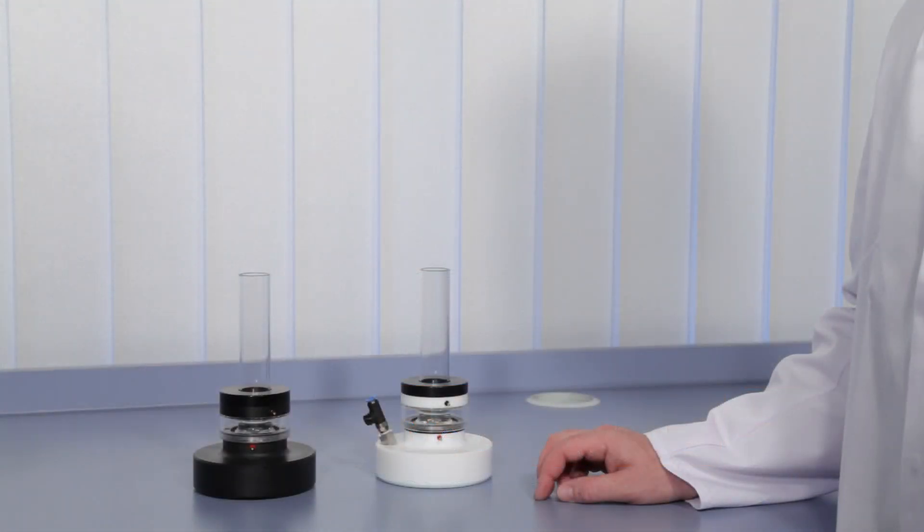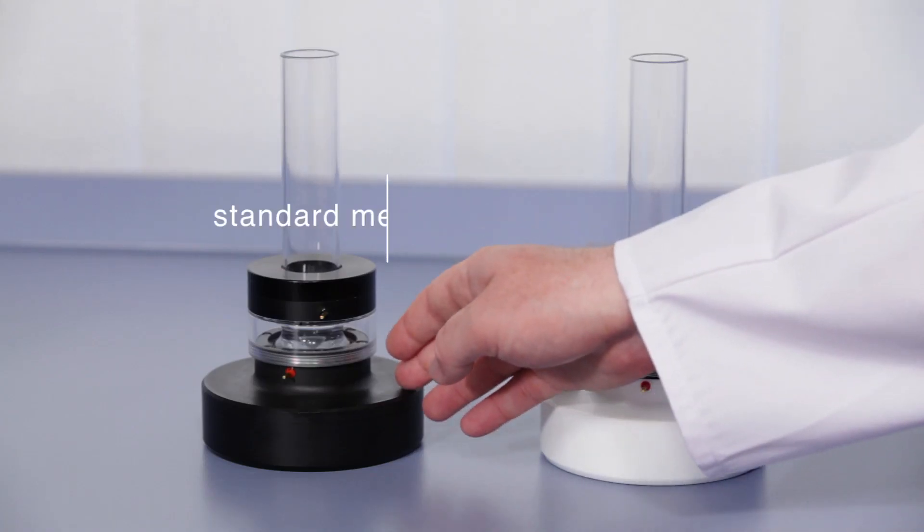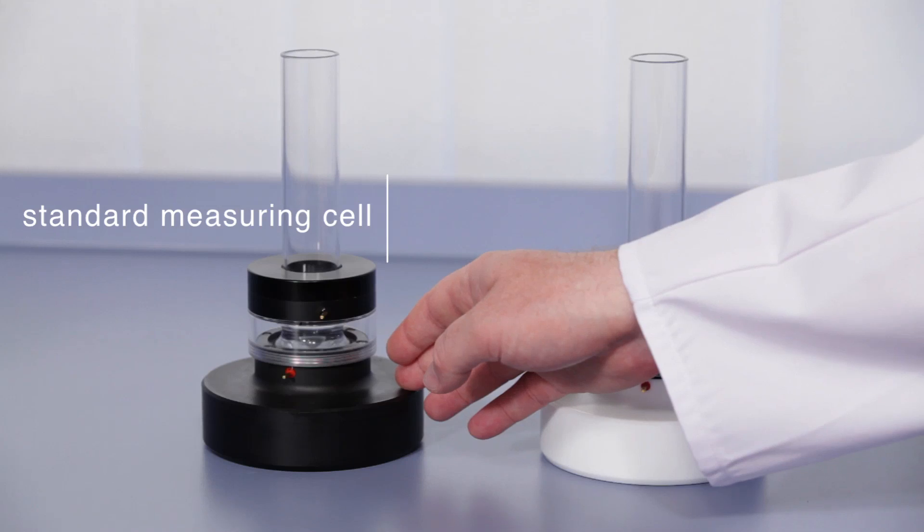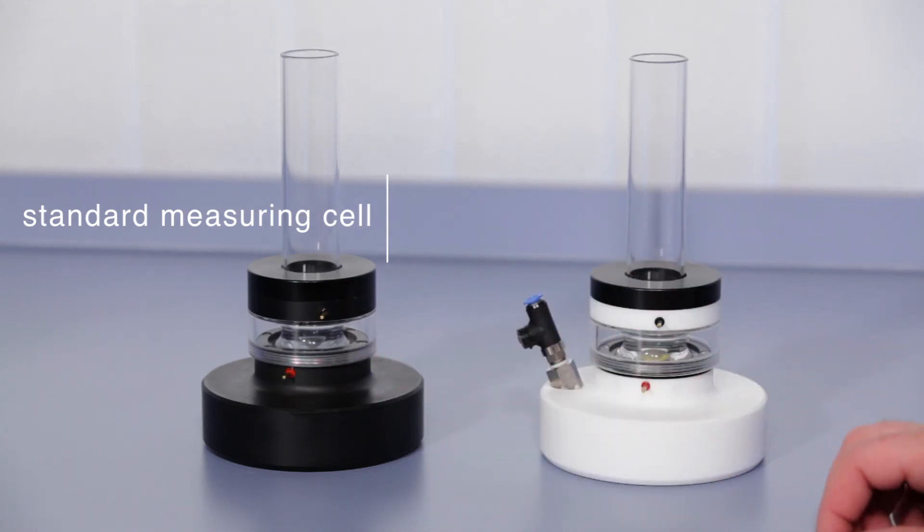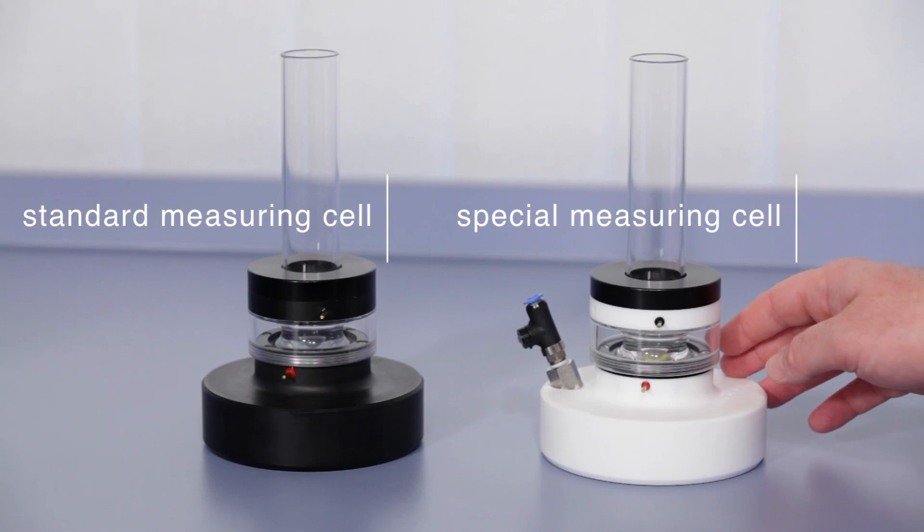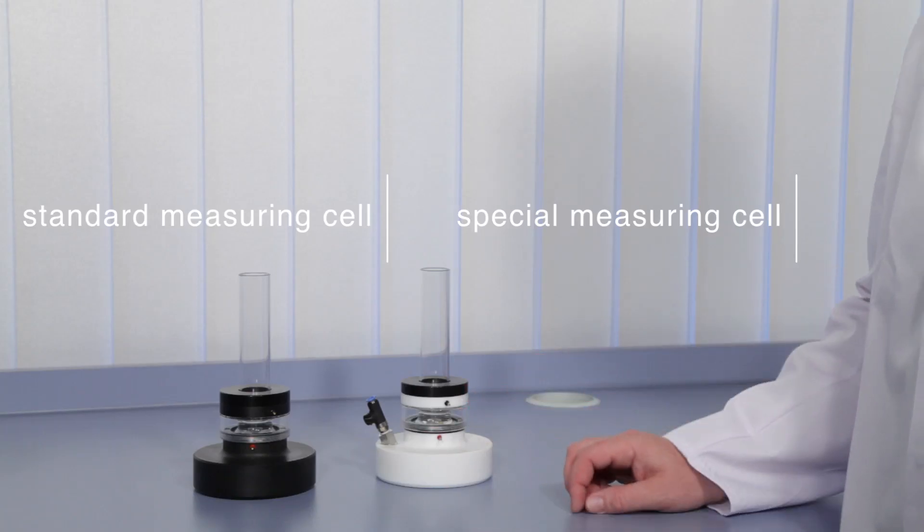The SZP has two different measuring cells. The black one, the standard cell, is used to measure fibrous suspensions. The white one, called special measuring cell, is optimized for measuring pigment slurries or other fine dispersed samples.